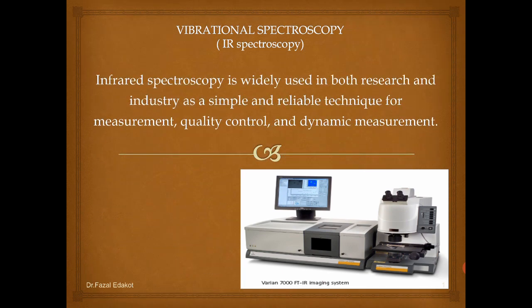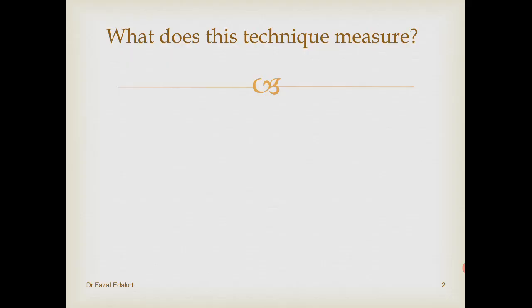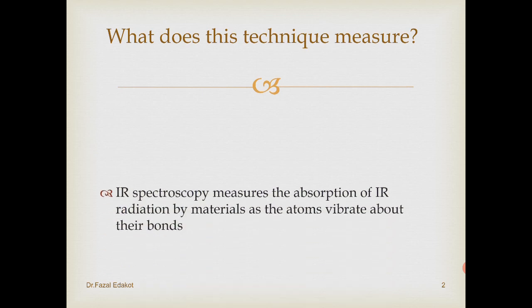Infrared spectroscopy is widely used in both research and industry as a simple and reliable technique for measurements, quality control and dynamic measurement. These are the broader applications of infrared spectroscopy. What does this technique measure? Let's see what this technique measures.